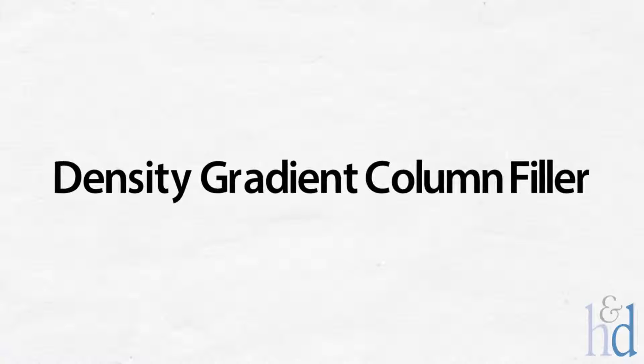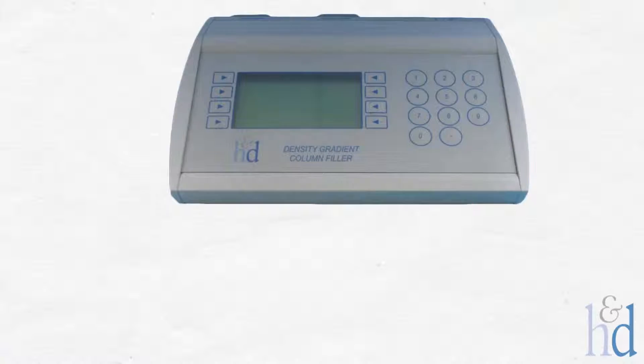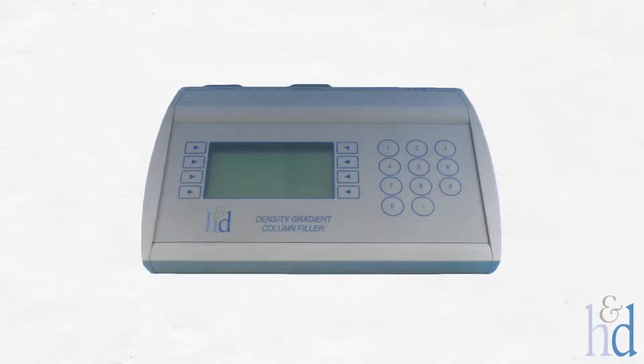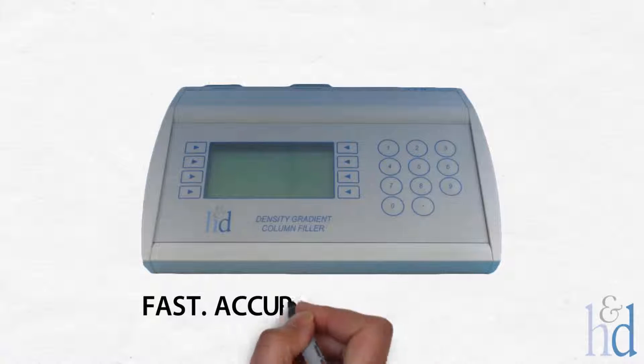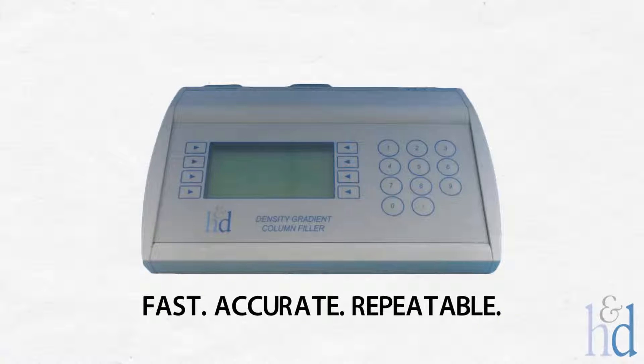Introducing the density gradient column filler. H&D have developed a fully automatic density gradient column filler. This instrument provides a fast, accurate and repeatable way of building density gradient columns.